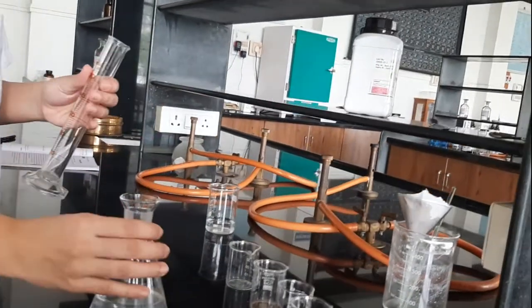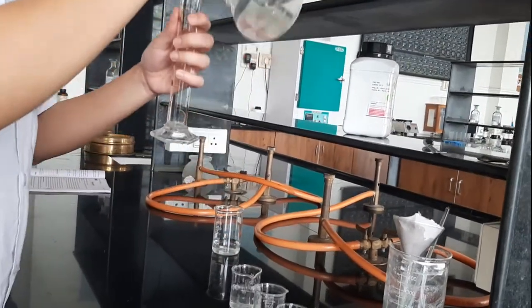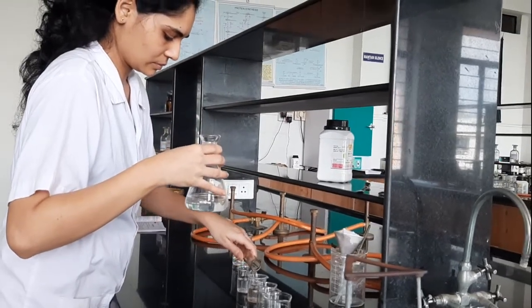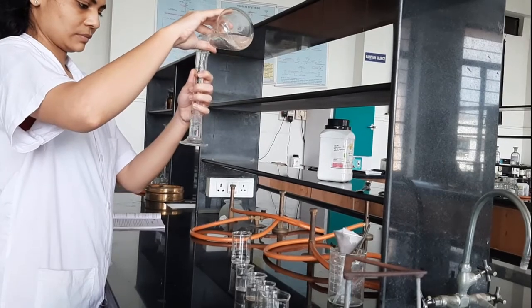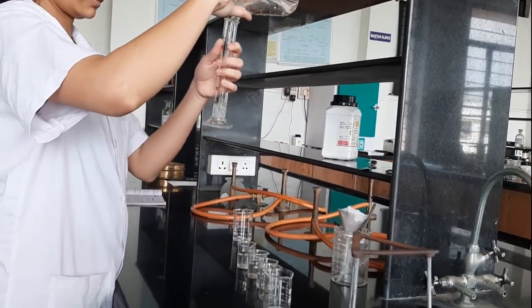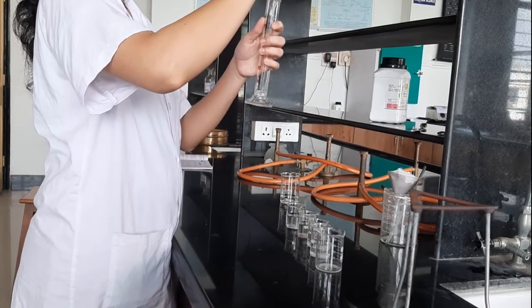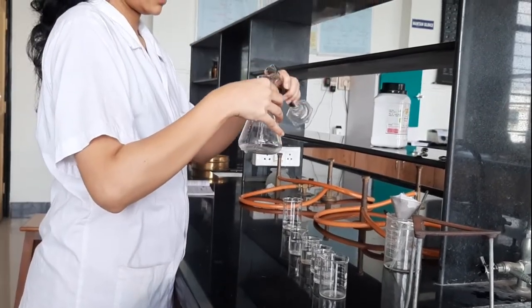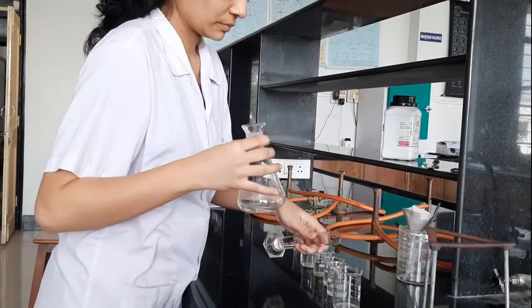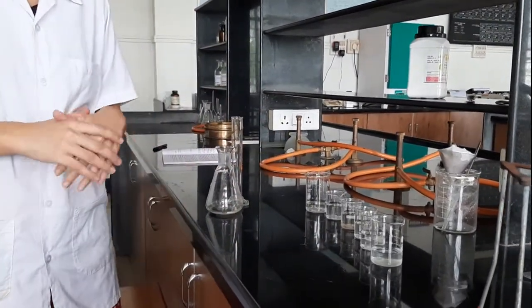So this is our 10 minutes. We have started the time. We will wait for the next 10 minutes. We will keep these beakers in cool water, and then we will wait for 10 minutes.